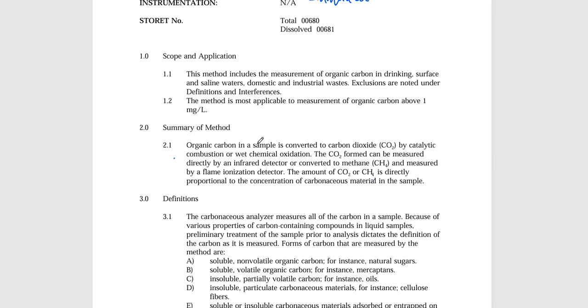The method is most applicable to the measurement of organic carbon above 1 milligram per liter. And again, milligram per liter is parts per million. That is what that unit represents.